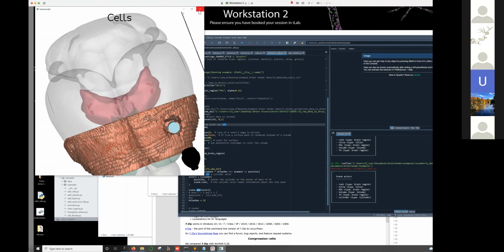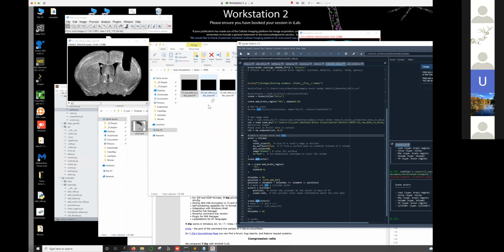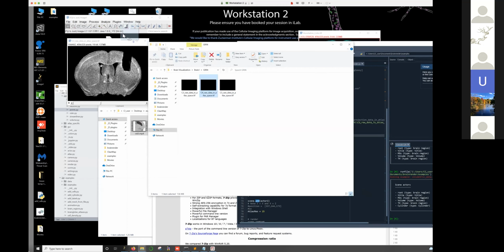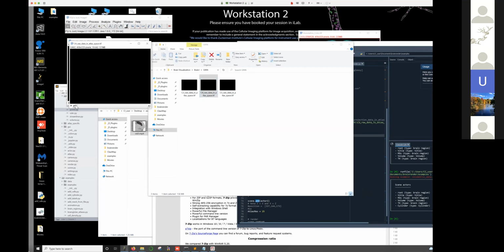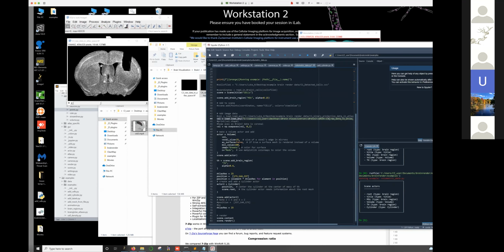And what we can do to look at this a little bit more clearly, I've annotated this data a little bit, and in this one, I've kind of just filled in the area where we know the imaging plane was. That's in C4. And what I'm going to do is actually say true here to turn it into a surface. So it's going to be filtering out a lot of the intensity from all the DAPI. It won't be perfectly clean, but it's going to be pretty clean once I put the threshold up pretty high here.